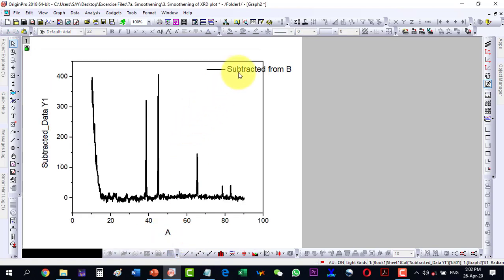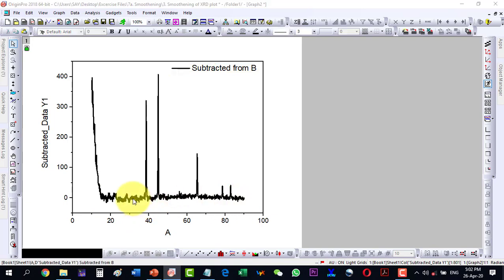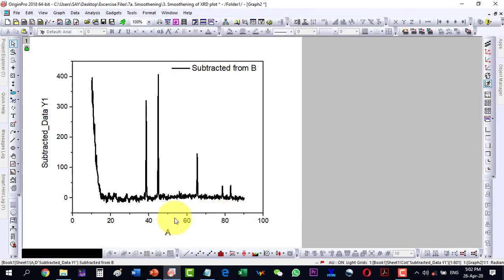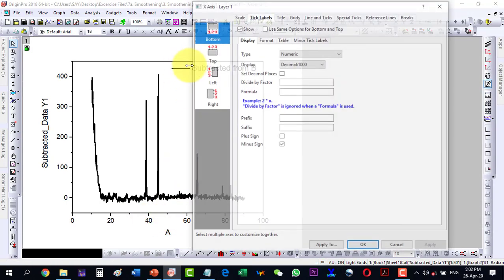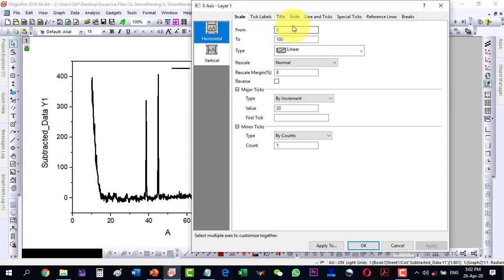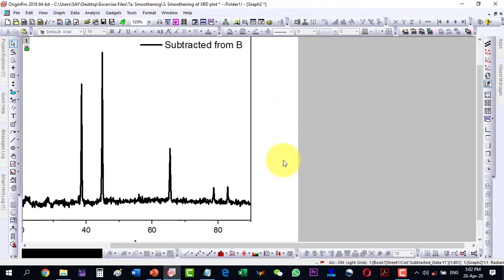Okay, and now let me plot it from 20 to let's say 90. So on the x-axis I am having from 20 to 90. Okay, and now the plot is fine. Let me zoom it a bit more.